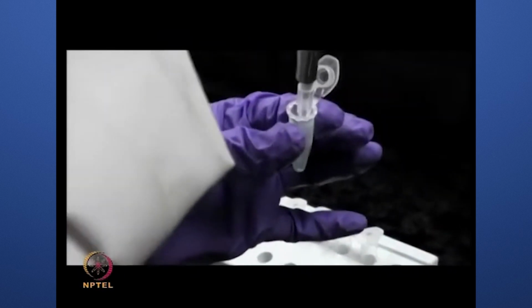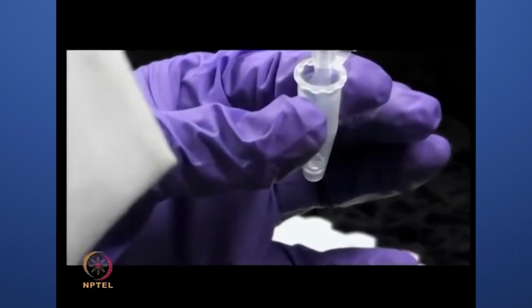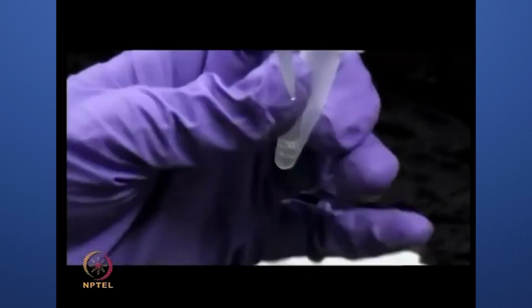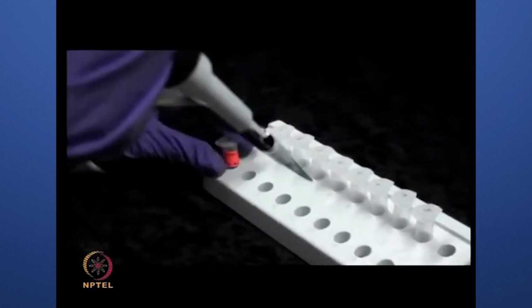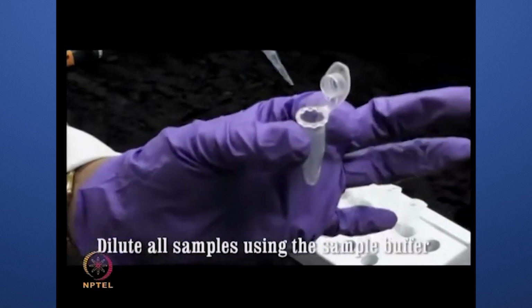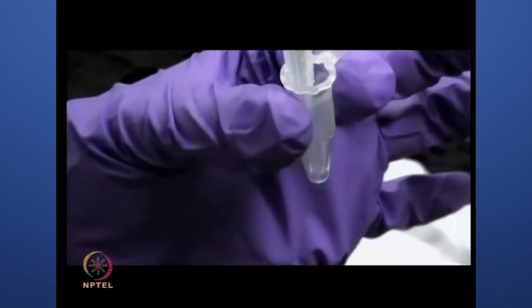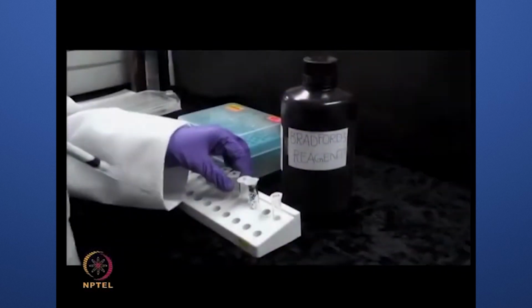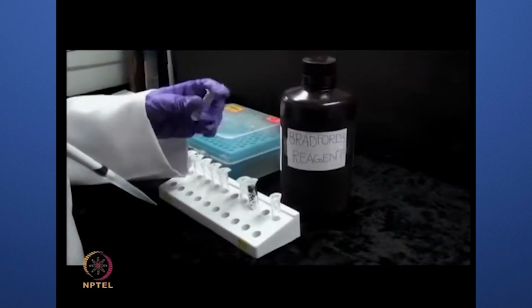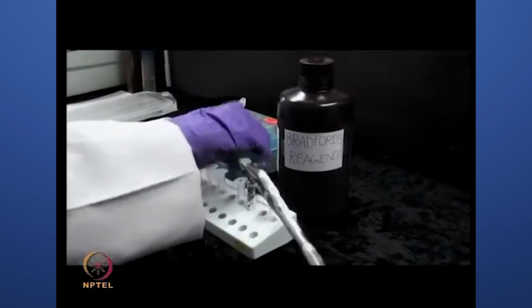Then add the unknown protein sample whose concentration is to be determined to the appropriately labeled tube. Dilute all the samples uniformly using the sample buffer. Then add the Bradford color reagent to each tube and mix well.